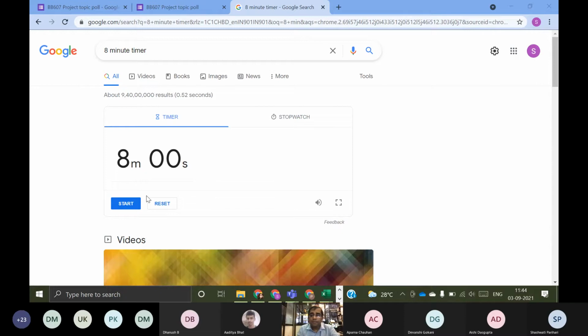So again, you can separate them on the SDS-PAGE gel. And after running from the gel, all those interferences are gone. And then you can clean up these gel pieces and proceed for the in-gel digestion. I hope that gives you a balanced perspective of choosing both.